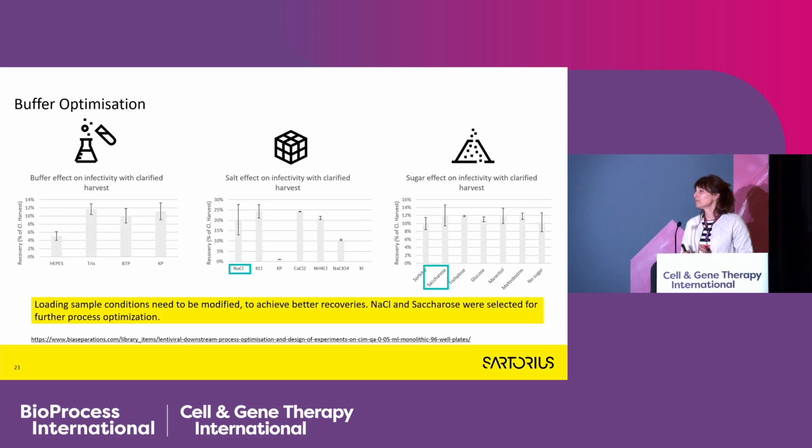We approached this case first with a really basic study to see which conditions needed to be optimized further. We selected the buffer, the salt, and also the sugar to see whether any of them have an effect on lentivirus recovery. We screened different buffers and saw that, with the exception of HEPES, all the other tested buffers were fine.